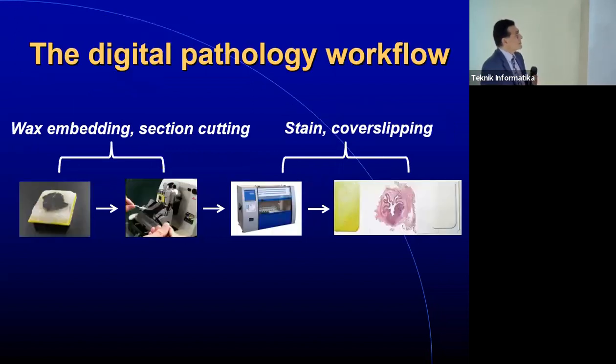Well, it might be easy, it might not be, because what you then have is a process whereby the tissue is put into these wax blocks. And then the wax blocks make the tissue stiff. And then you can cut thin sections of the tissue, right? And of course, that's straightforward, it's technical, except the quality of the wax may affect the way that the tissue behaves. And then you can see here, there are thin sections. This is a very thin section of the tissue being cut here. But the thickness of the section can vary from one day to another, between one technician or another. And if you imagine, we're going to be looking at images, the thickness of the section may be a crucial thing affecting the way that the tissue is evaluated.